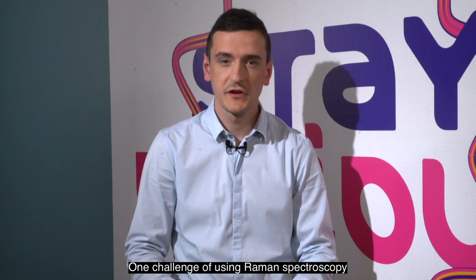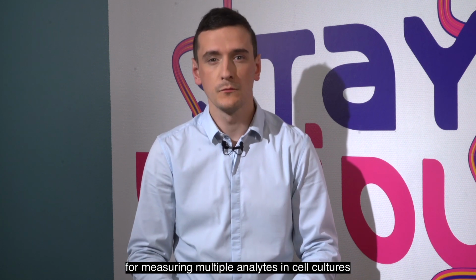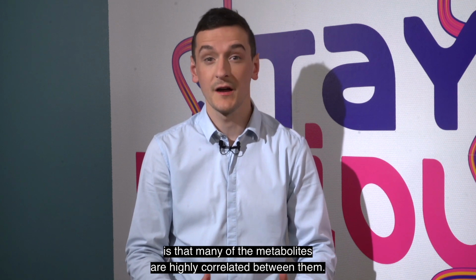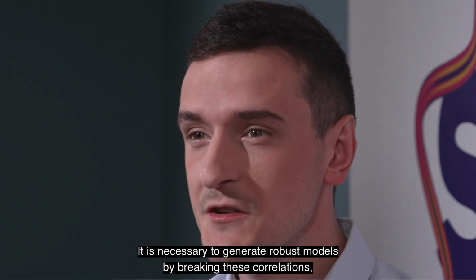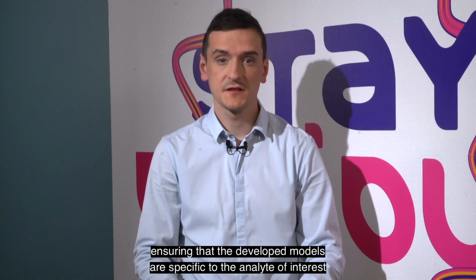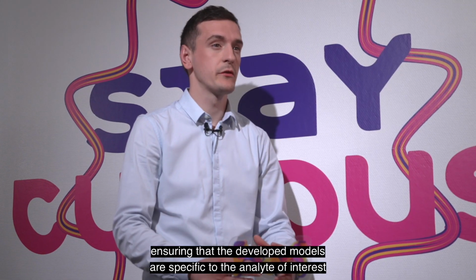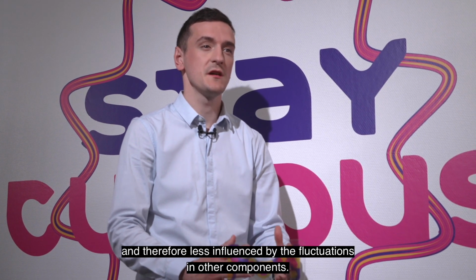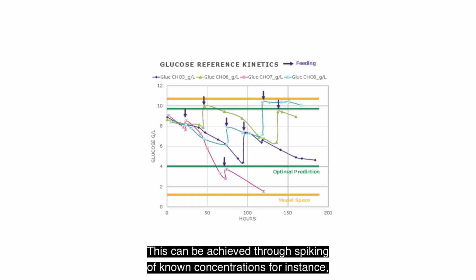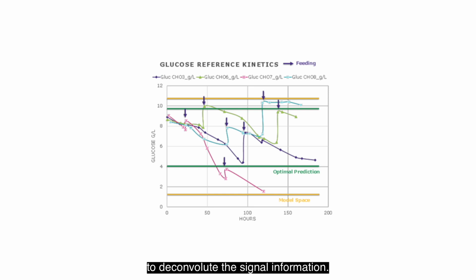One challenge of using Raman spectroscopy for measuring multiple analytes in cell cultures is that many of the metabolites are highly correlated between them. It is necessary to generate robust models by breaking this correlation, ensuring that the developed models are specific of the analyte of interest and therefore less influenced by the fluctuation in other components. This can be achieved through spiking of known concentration, for instance, to deconvolute the signal information.